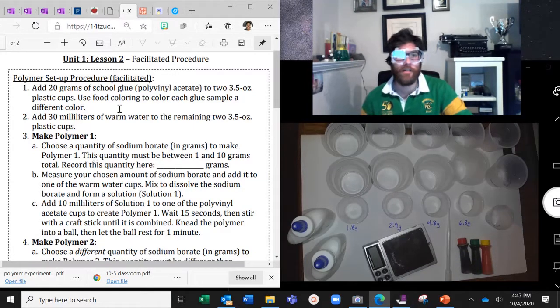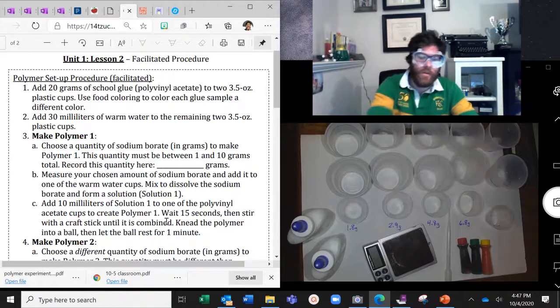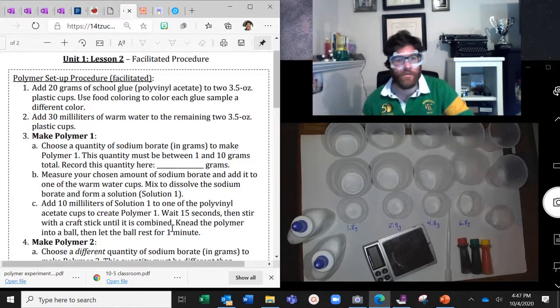We can read the procedure here. I just sort of explained it to you, but we've got 4 different polymers that we're going to be making with different amounts of sodium borate, and we're going to turn them into little bouncy balls to see if they can bounce different heights or what's going to happen there.